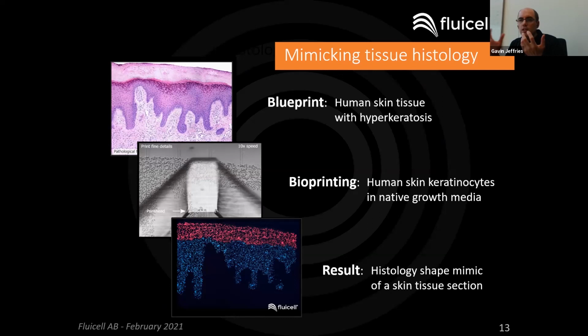We establish our recirculation zone, or hydrodynamically confined flow zone, and then we translate the surface around to replicate the pattern that is desired. What we have is a base model, or a starting point, which can then be interrogated directly, or it can be cultured or manipulated or have additional things added to this structure.